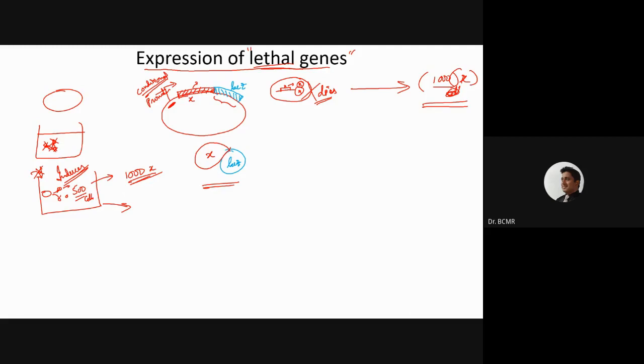So again, we need to put in an enterokinase site or anything that can be cleaved at a later stage of downstream processing. We take this protein, and then we use the specific protease we may have added to this, so that it will separate X, and lac-Z will be eliminated. We can purify it using gel filtration or ion exchange based on our availabilities, and then we can test its biochemical activities and so on.